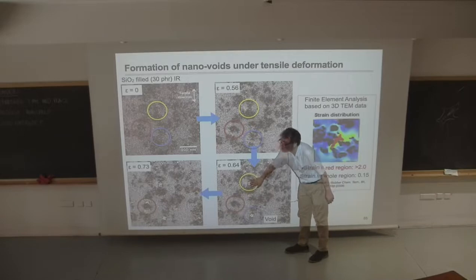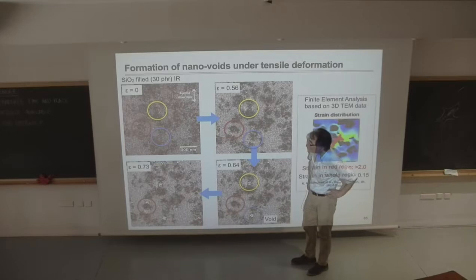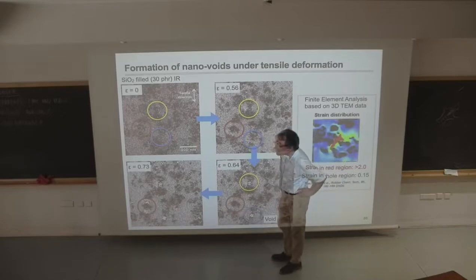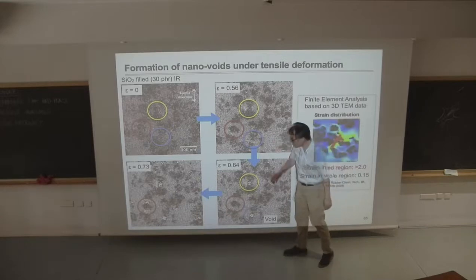I mean, aggregate. Yes, please. I have a question. For me, there are two different mechanisms. One, the pillars are going away from each other, and this is the blue behavior, and the red behavior is the contrary. The carbon black pillars or the silica pillars go back, and then a void occurs around this path. So for me, there are two different. Okay, maybe two different, three different, depending on how you look. For me, these two look similar, but maybe not so. Okay, anyway, thank you.